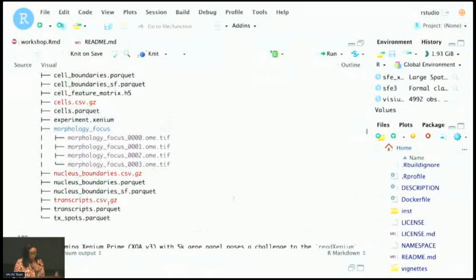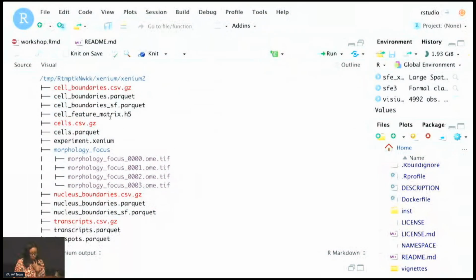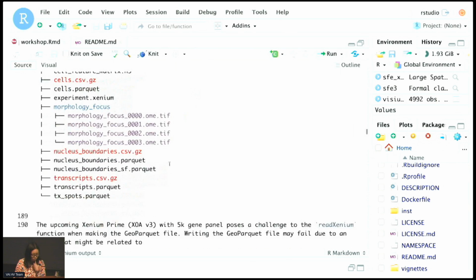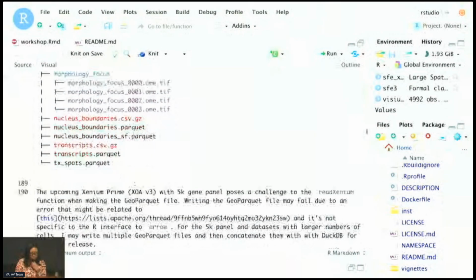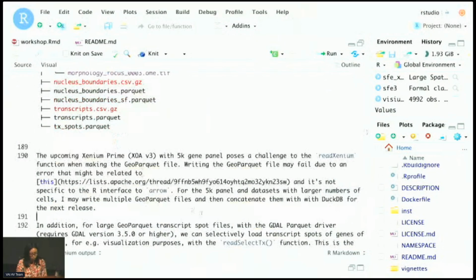In the directory, we see that we have the sf.parquet files written by default into the same output directory. So next time we read the data, readXenium will read the GeoParquet file, which will be faster. And txspots.parquet will be the GeoParquet for transcript spots.